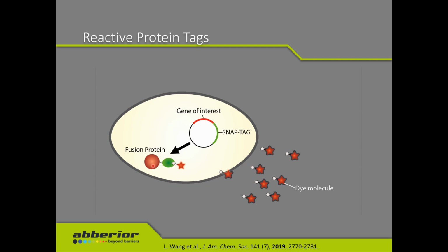However, those protein tags are quite large, about the same size as fluorescent proteins. If you have listened to the first talk by Stefan Hell, in the beginning of July, where he talked about MINFLUX microscopy, then we know that from the physical side there are no limitations anymore to reach resolutions down to 1 or 2 nanometers.